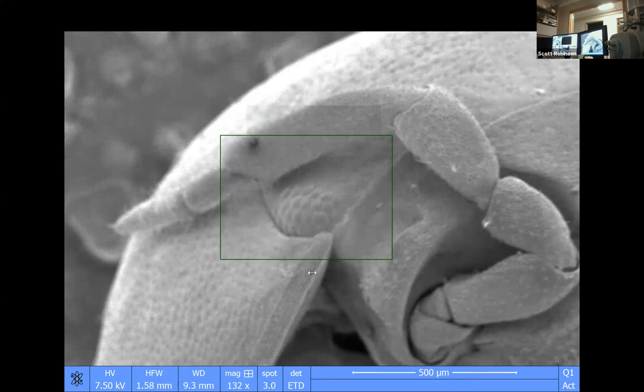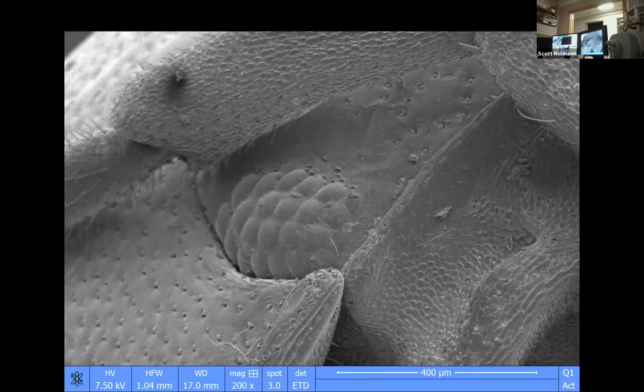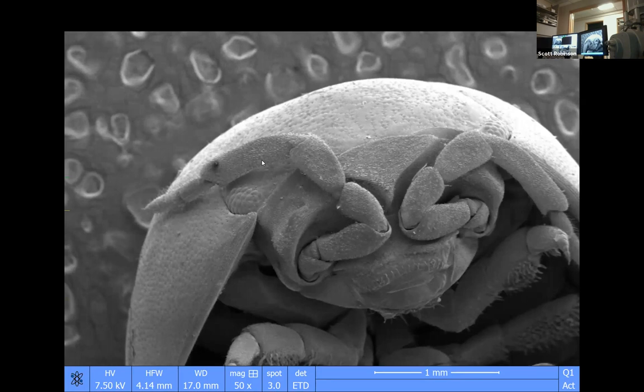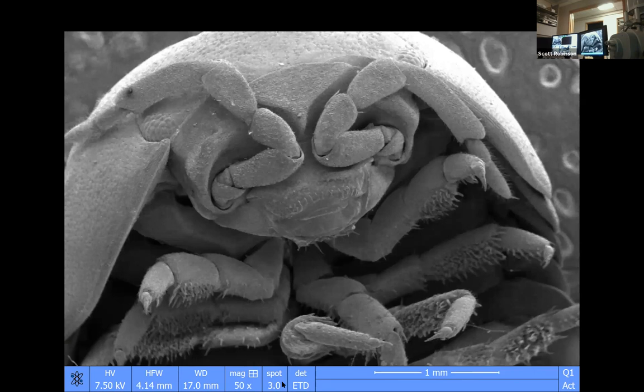whatever is in here. So right now we're focusing on one of the compound eyes of this roly-poly. And so it looks like a little raspberry, and they probably cannot see very well. It's a really kind of a primitive eye. The things that you see that are bent around on each side that look kind of like horns are the antennae. And then you see that the roly-poly has a kind of like a mustache, but it's kind of like a weak one.